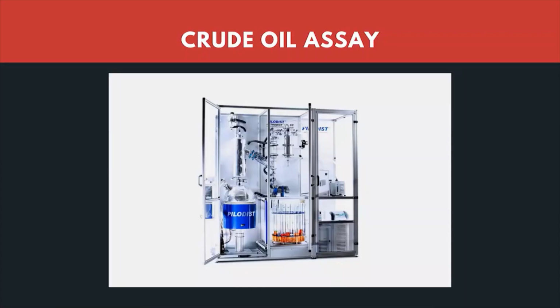The purpose of intermediate samples is to reduce the surprises once the tank is full. So, the quality control lab is not only testing the finished products, it is also testing intermediate products, and it is also testing the raw material, that is the crude oil.